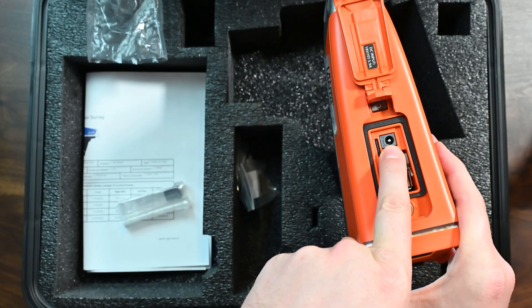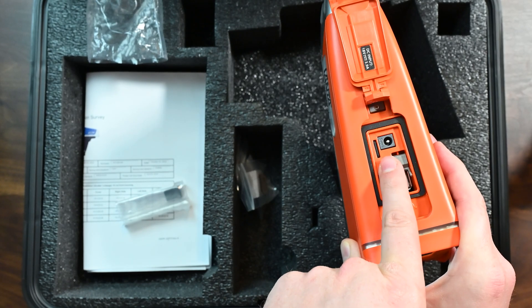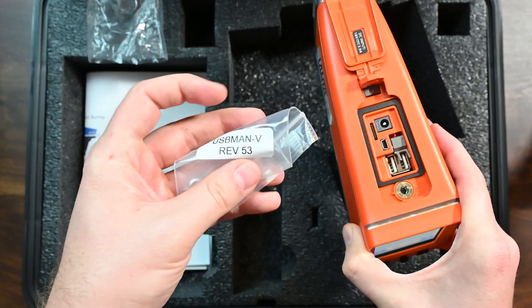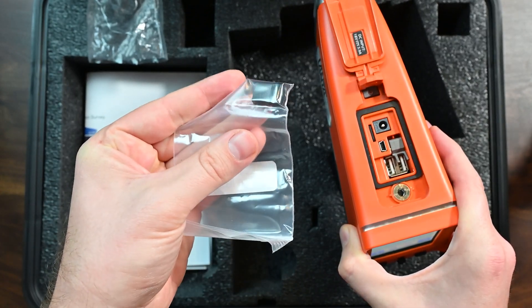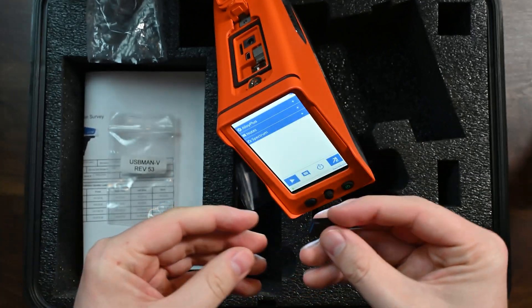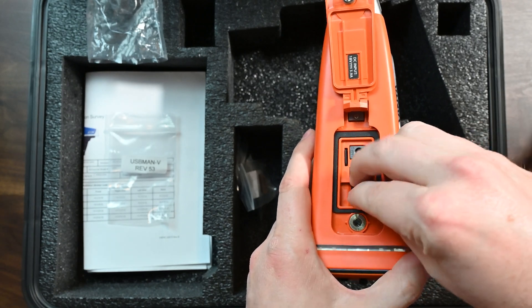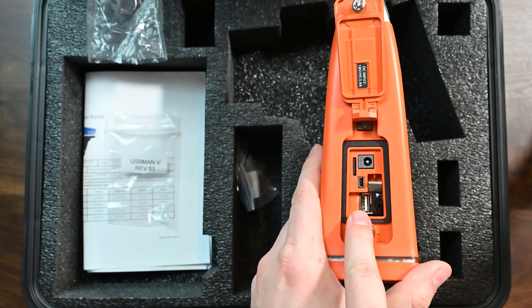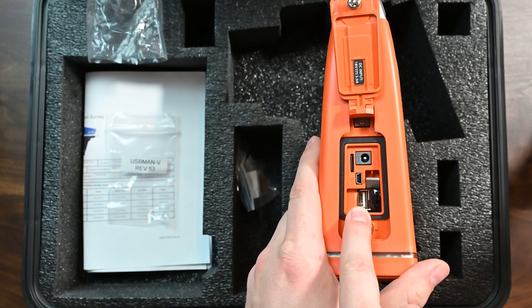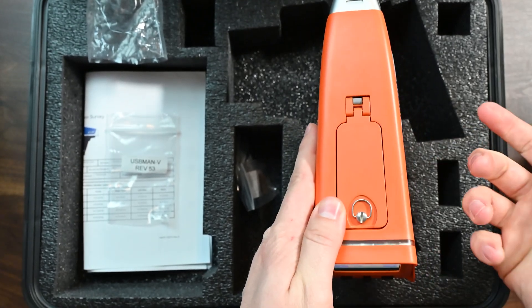That's your power cord port — that's where the power cord goes. It's a pretty standard power cord and you can find that on allygeek.com. We've got an SD card there, a USB port here, and two USB ports here for things like this little thumb drive, which can go in that port. There are some cool designs by Olympus to help miniaturize the design. This little piece also helps you remove the USB drive once it's in there — it goes down flush. You can also put in a USB drive that does Bluetooth or a USB drive that does WiFi. You can find those dongles on allygeek.com if your instrument didn't come with one. This hatch just pushes shut and you do a quick twist — no tools necessary.